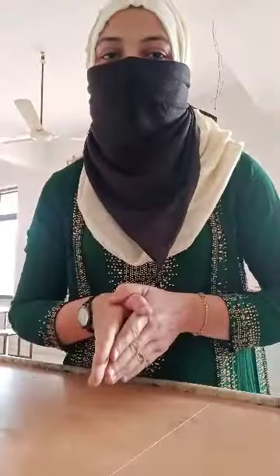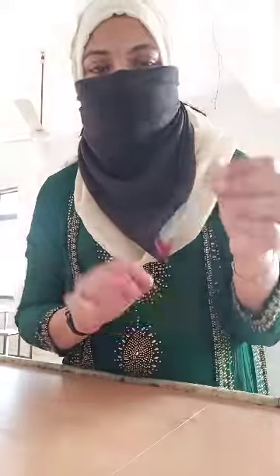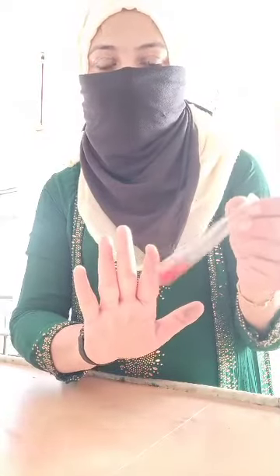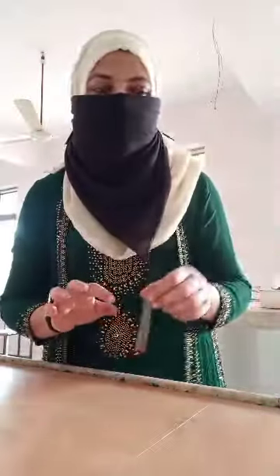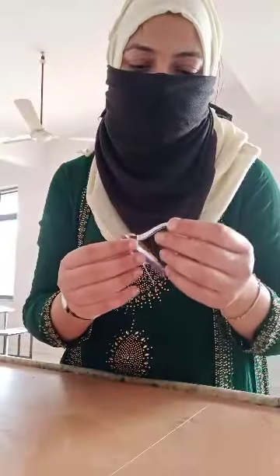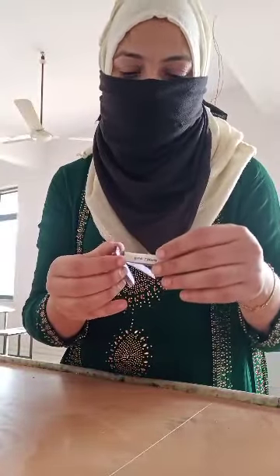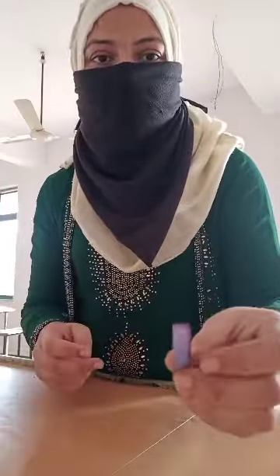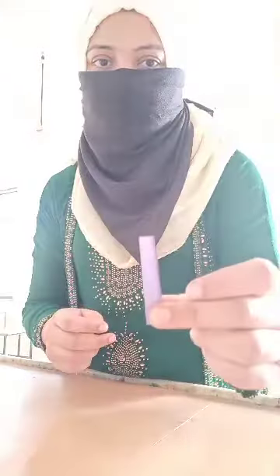Assalamualaikum dear students. First of all, we have seen all the tests of the alcohols. Now we are going to see the test of the phenols. The phenol color is like this — red in color — and we are going to check this particular compound. The first important test for phenol is checking it with the litmus paper. We are going to use the blue litmus paper and place a drop of our compound on it.